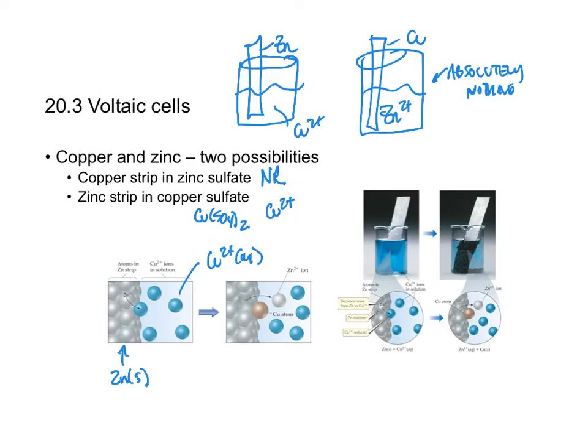What happens is a redox process, and that's what we're going to talk about here. As time goes on, we see a black precipitate forming on the zinc. That black precipitate, when it falls to the bottom of the container, is actually a beautiful copper color. And what it is is copper as a solid. I always say nothing up my sleeves. I didn't add anything. This is a spontaneous reaction. This is where you have a negative delta G.